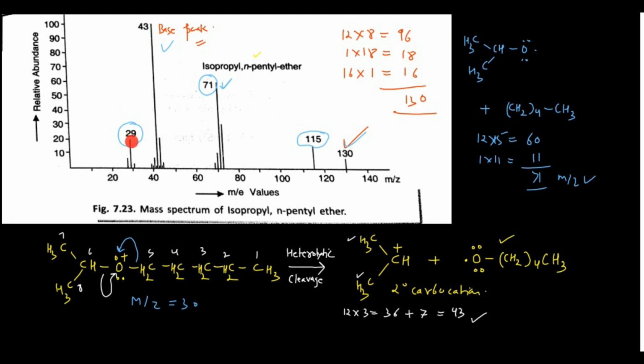Or if you want to, you can do it by yourself, how your beta cleavage is happening in that case, or other cleavage. But it is not necessary in the IR spectrum as well as in the mass spectrum to explain each and every bond. If you are able to explain your molecular ion peak and other significant peaks, then it will be quite obvious. And of course this is produced somehow with the removal of the ethyl cation, C2H5 positive. It is produced due to this one.